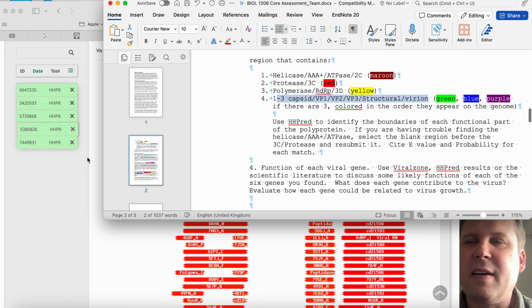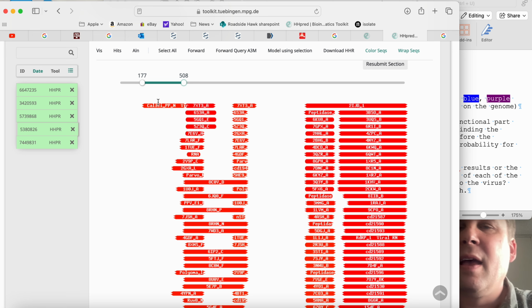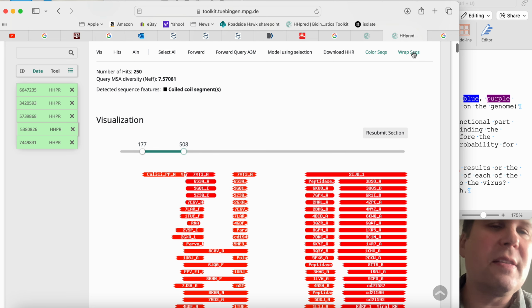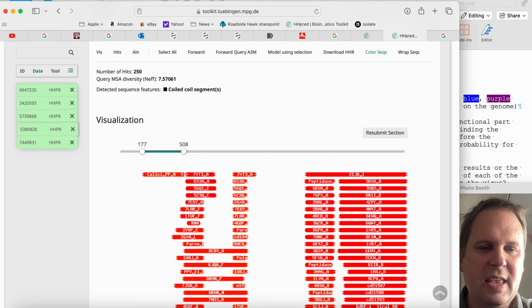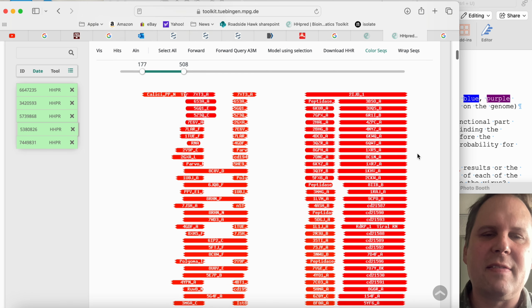All right. So let's go back. The thing I told you to do was to wrap the sequences. So we'll do that. You hit that once, and it just puts each one on one line. And that's fine. You just have to scroll to the end to see the end of it.